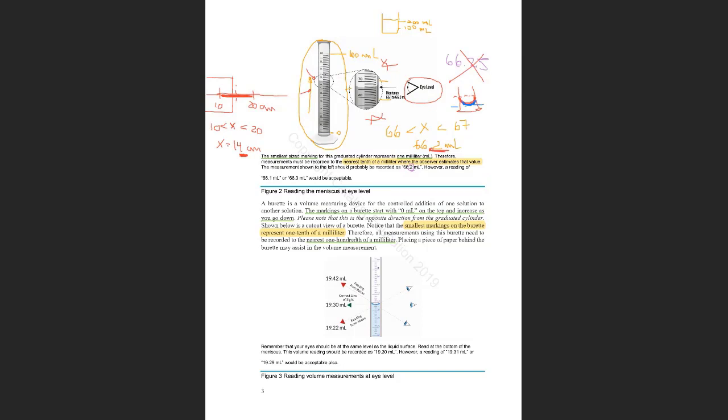And another way of measuring volume here is using a burette. So what is a burette? We saw a graduated cylinder, we saw a beaker.